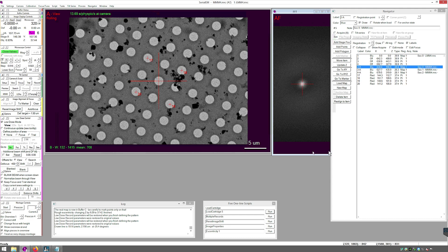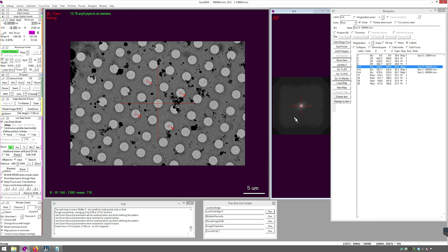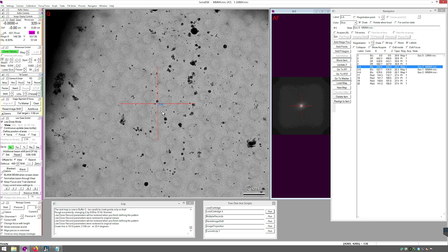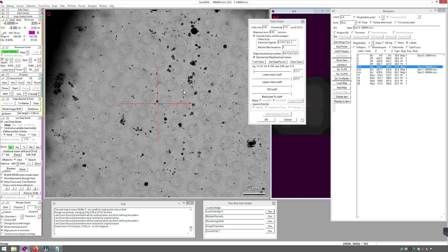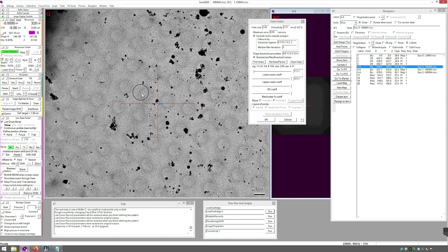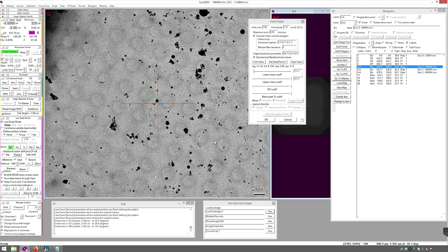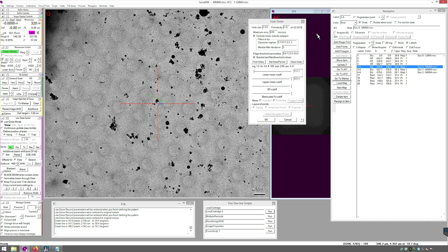Now we will be finding holes on our grids. Double-click your first MMM and open Hole Finder: Navigator, Montaging and Grids, Find Holes in Regular Grid. Input the two inputs. For Hole Size, measure the diameter of one of your holes using Shift and Left-click. For Periodicity, measure the inner hole spacing — go from the center of one hole across to another; do not go diagonal. Type those two numbers in and press Find Holes.